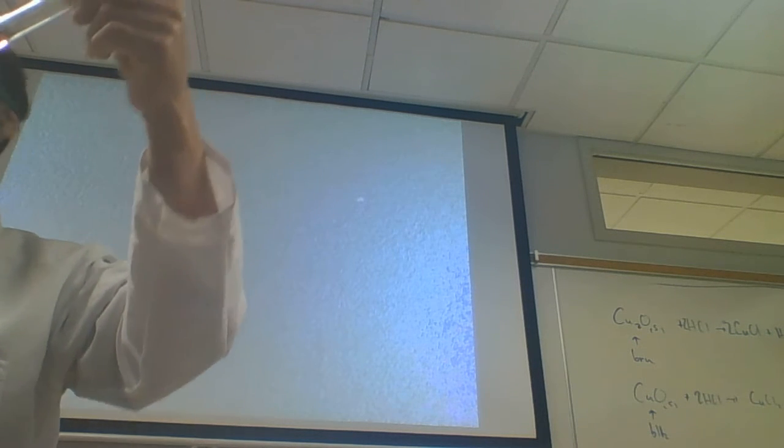Well, I actually can't see anything here, but sometimes reactions are sluggish, especially if you have an oxide coating on there. And so normally we give it some time. We'll come back to it, but I don't see anything happening to it. Let's check it again after a few minutes. Okay, then after that we go to what?